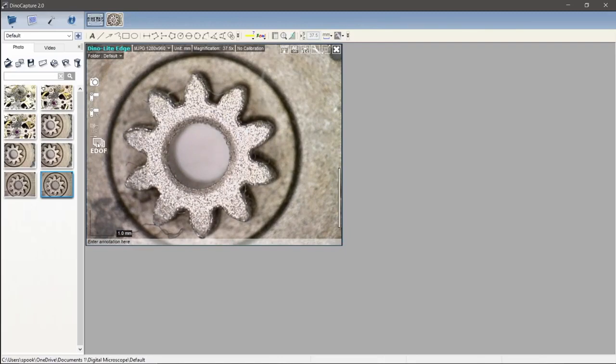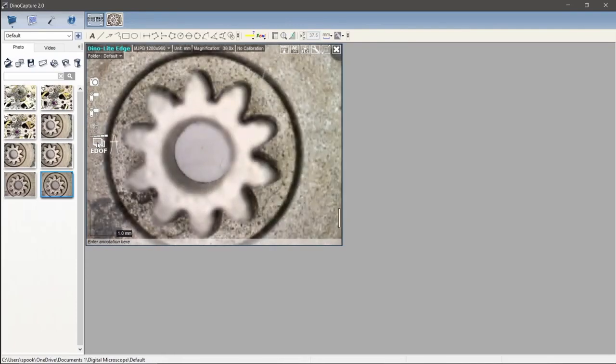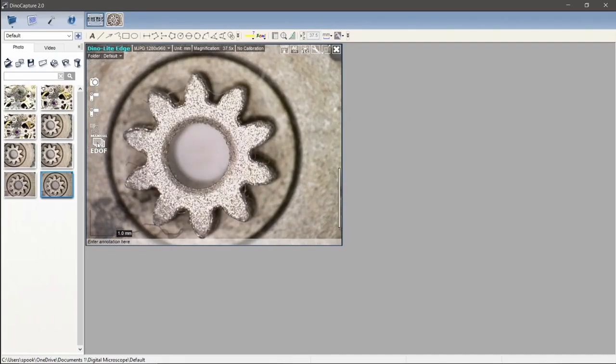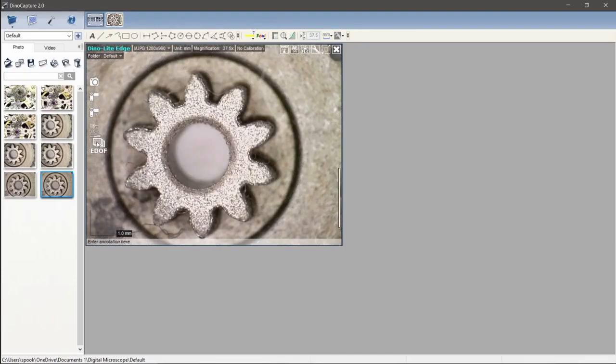So what I'll do is hover over that icon, and I'll use my scroll wheel, and you'll see another dot appear above that icon, and that means it will go further. I can keep extending this until I am getting the entire object in focus all the way up to here, and then the last step will go to manual, to where I can set different points for it to go to manually. But for this one, we're just going to keep it in auto. I'm going to keep it on the 3 dots. I'm going to let the preview finish. Give it a click.